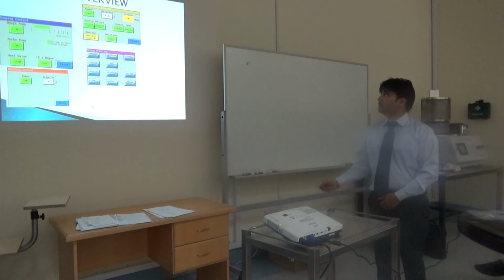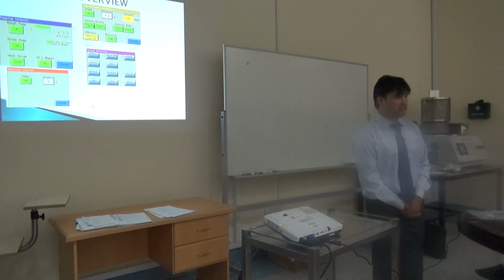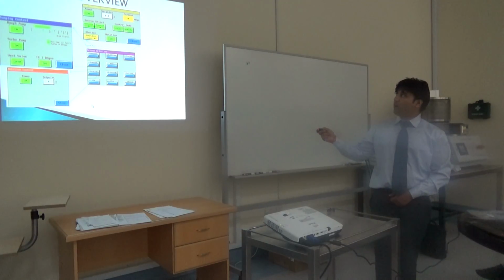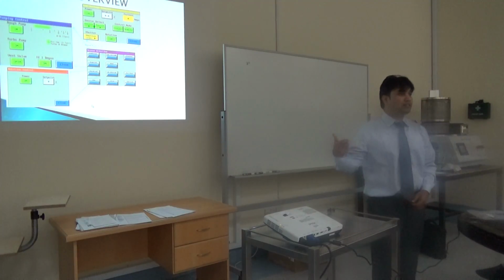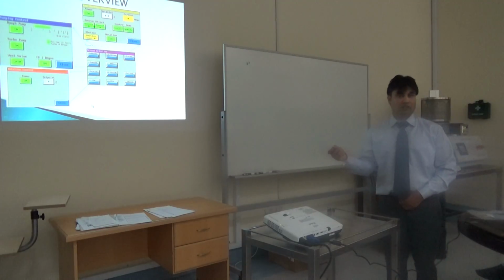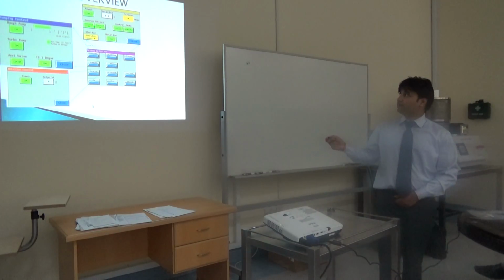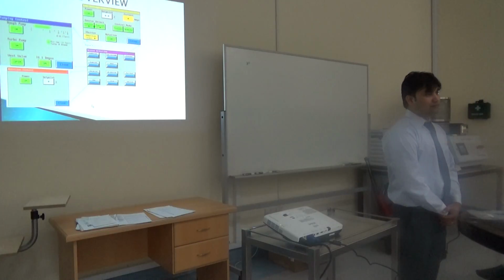Next, if you touch this display, this is called the low voltage control. In the low voltage control, we can access this tab. In the first line, this is called the power set point, and it will show the current. Generally, this power line we always have to set in percentage, 10%, 20%, 30%, and we have to monitor what the sustainable power is for our filament. Is it the filament only or the material also? Because if you have an organic material, it evaporates at very low temperature. So it's not only the filament, you also have the choice of material that will evaporate.